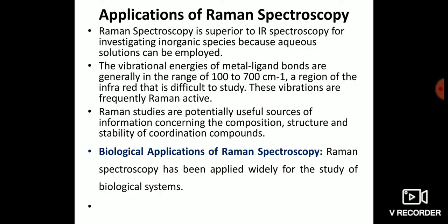So let us consider the applications of Raman spectroscopy. Raman spectroscopy is superior to IR spectroscopy. First of all, we must remember this for investigating inorganic species, because aqueous solutions can be employed. राइट. तो इसमें एक इम्पॉर्टेंट बात आप याद रख सकते हैं कि रमन स्पेक्ट्रोस्कोपी में हम एक्वस सोल्यूशन एम्प्लॉय कर सकते हैं, यूज़ कर सकते हैं.